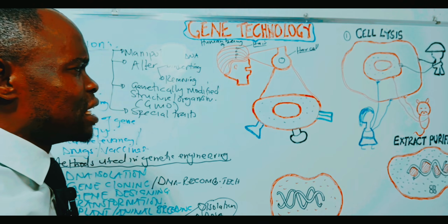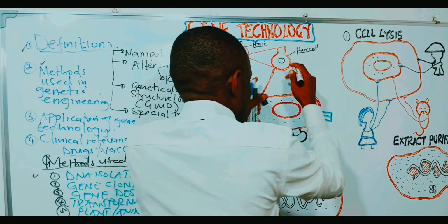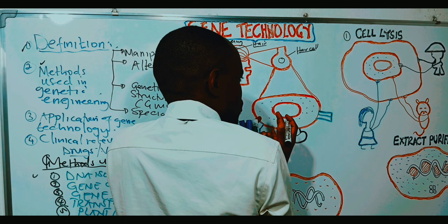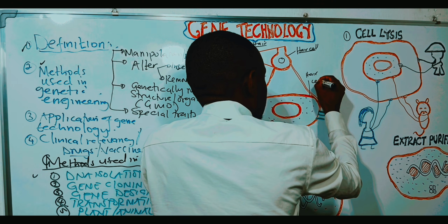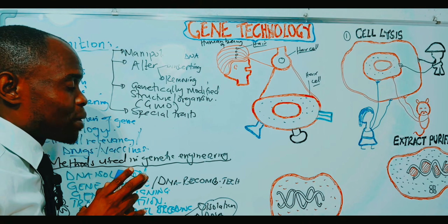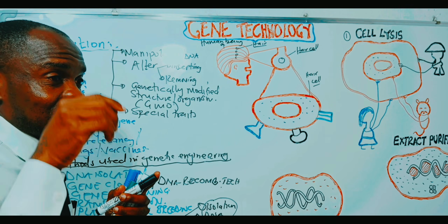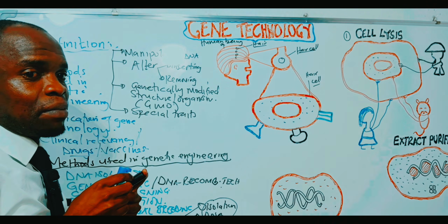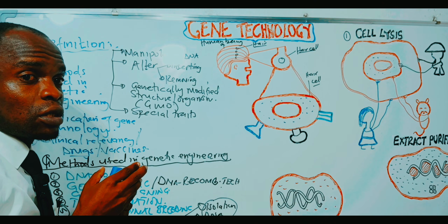Now I want to examine this hair cell further. What am I going to do here? I'm going to magnify it better. This is the next zooming. I have made it bigger. This is still the hair cell. Once the hair cell has components, what are we looking at? We are looking at how DNA is isolated, members. You get the point? We have begun the procedure now.